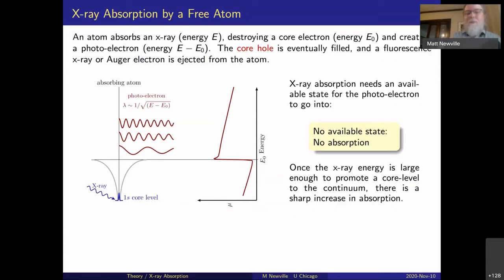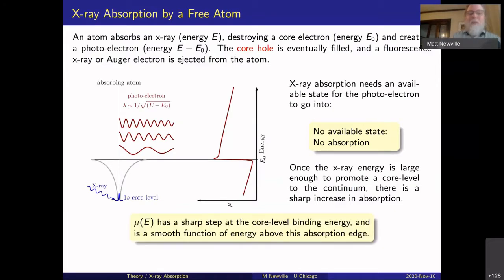And that's so the edge comes from the core level binding energy and the absorption threshold, the density of states for that photoelectron to go into. And that depends on which quantum number it is. So 1s has to go to p. So this is the p density of states. I'm sure that the theoretical calculations described will go into much more detail of that.